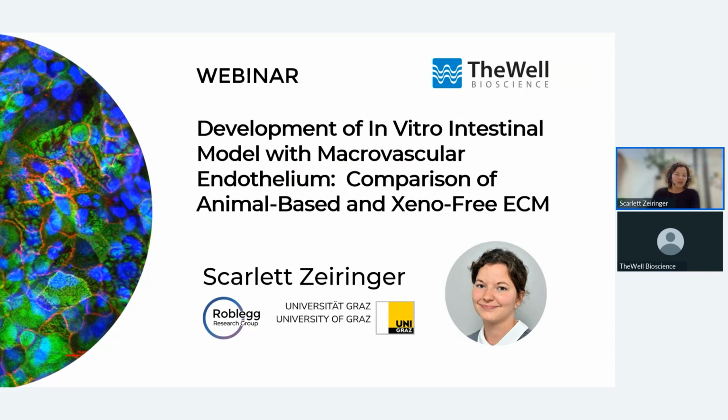I'm a PhD student at the University of Graz, as Christopher mentioned. I'm working and focusing on the development of in vitro barrier systems, and today I will be talking about the development of an in vitro intestinal model, considering the macrovascular endothelium and the comparison of animal-based and xeno-free ECM systems.